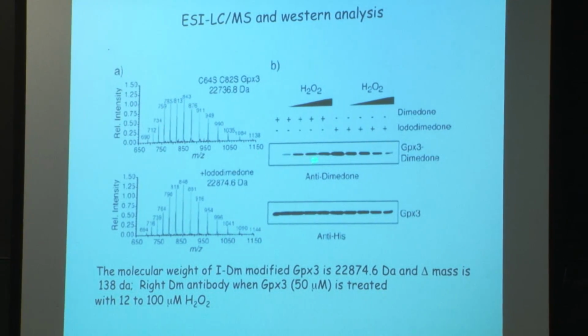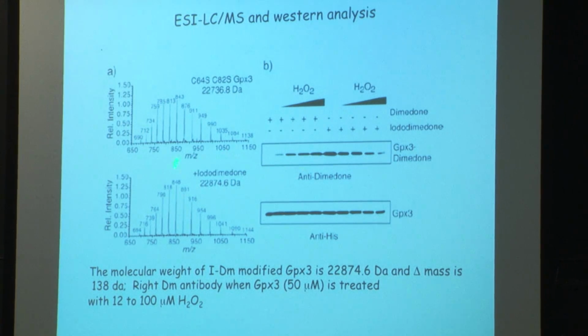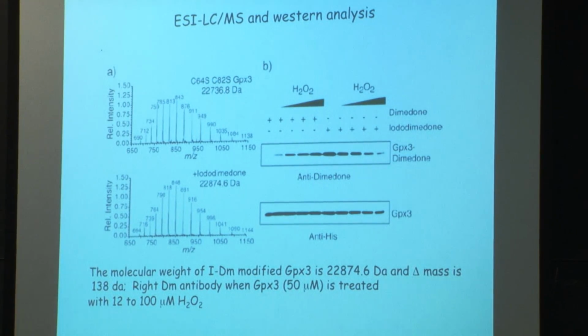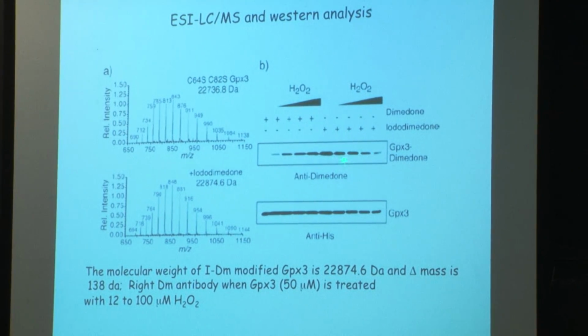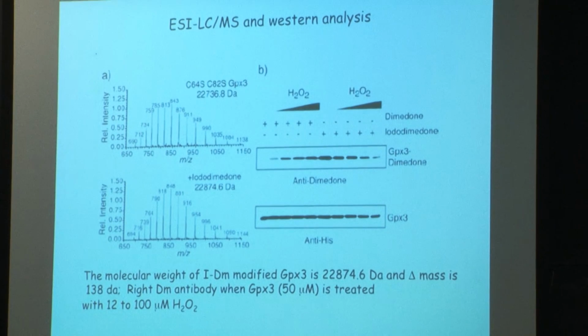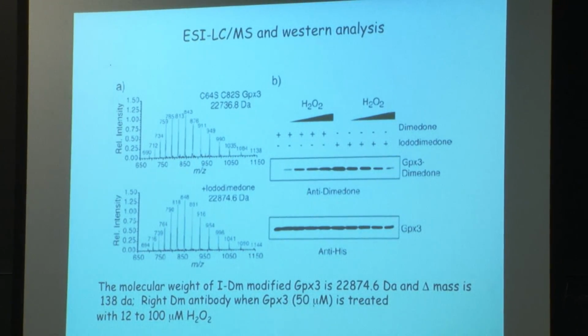So look at this. We're increasing hydrogen peroxide, and you saw it increases. Here we have just cysteine, and we're hitting it, of the 100%, with something that reacts with sulfhydryl groups, the iodo. And look at this compared to this. What do you see? What does it look like? It looks like there's more. Right, that's exactly it. And it's the eyeball method, so you can't tell anything by the eyeball method. You have to have a way of quantitating.